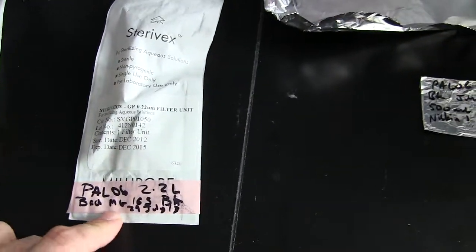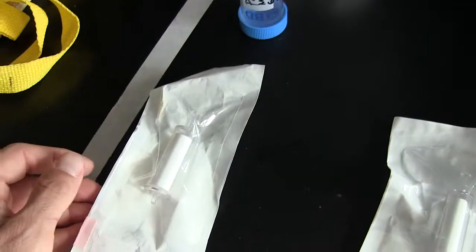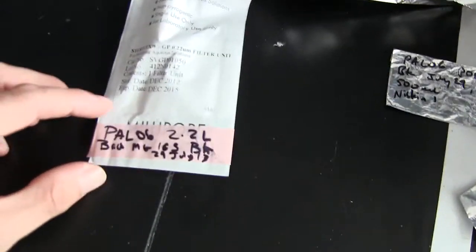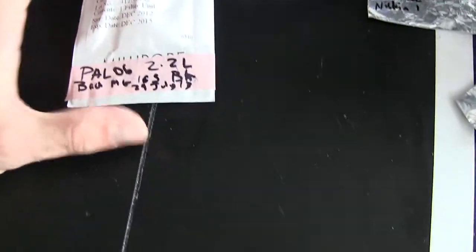Now that's done using a 0.22 Sterivex, as you can see here. Sterivex looks like this. It looks exactly the same as a 0.45 Sterivex over here. Exactly the same. This one 0.45, this one 0.22. Make sure you use a 0.22 Sterivex when you're doing your water chemistry work, which is from your Niskin bottles.